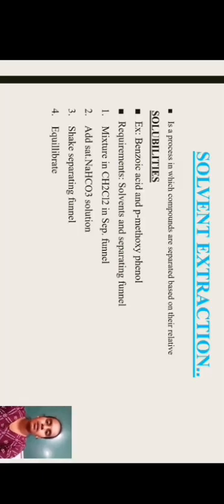Now I will discuss what solvent extraction is. Solvent extraction is a process in which compounds are separated based on their relative solubilities. In this solvent extraction we take the example of separation of benzoic acid and para-methoxyphenol. The requirements are solvents and a separating funnel. Mix in CH2Cl2 in the separating funnel, add saturated sodium bicarbonate solution, shake the separating funnel and equilibrate.